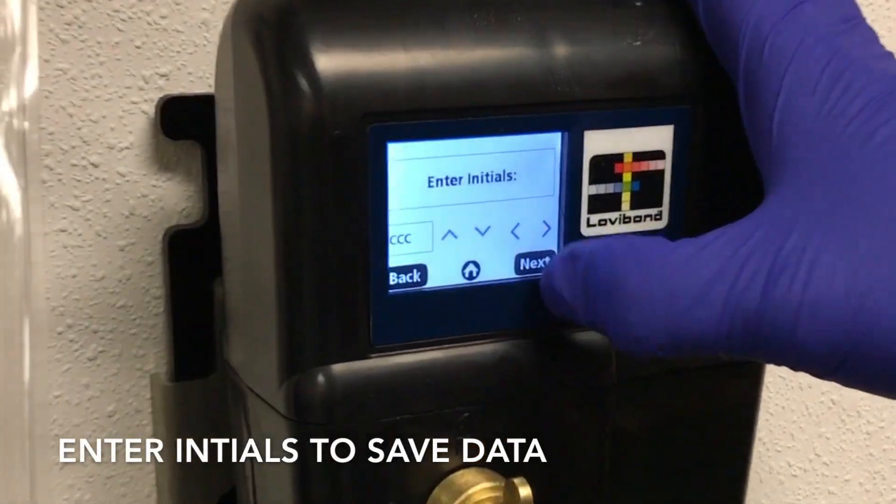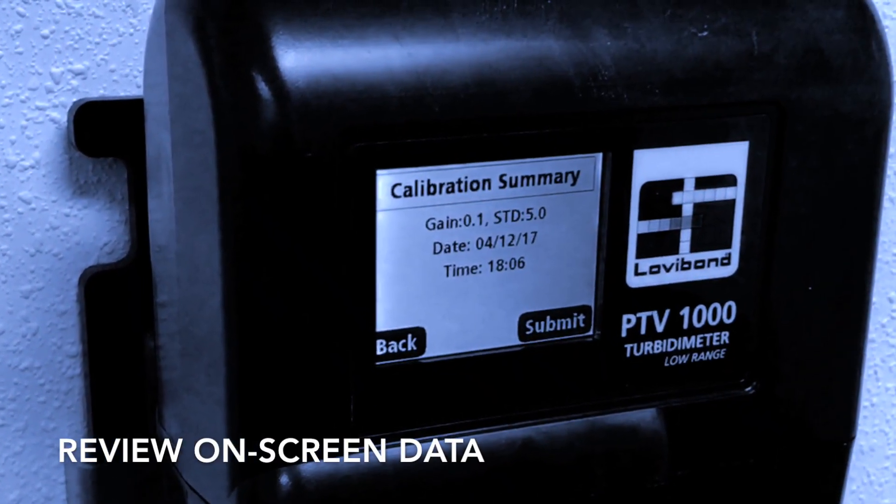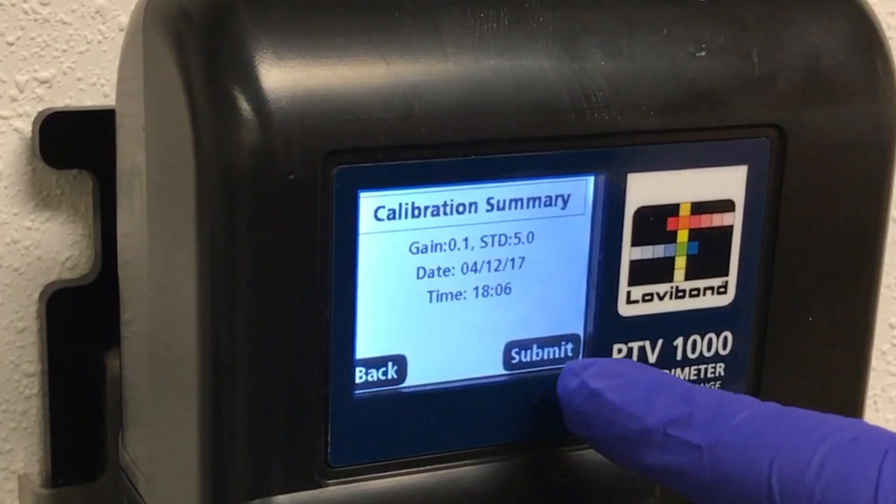Hit Accept once the outputs have stabilized. This will save the data and prompt the entry of the user's initials. Once entered, a calibration summary is presented for preview. You can submit the summary by pressing Submit.